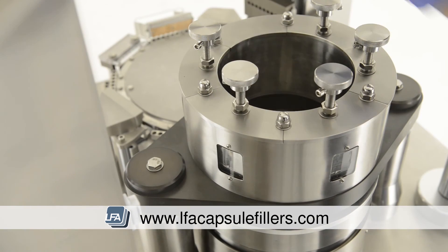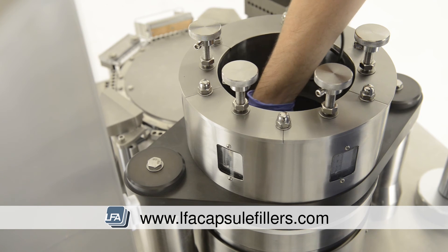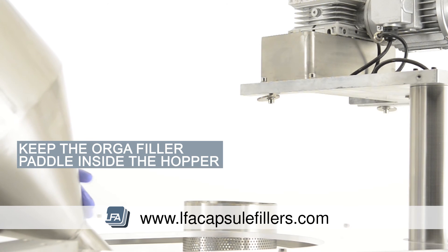Next, the sensor is placed back through the middle into the slot that was shown earlier. The hopper is lowered gently over the top down through the centre section, keeping the auger filler paddle inside the hopper.